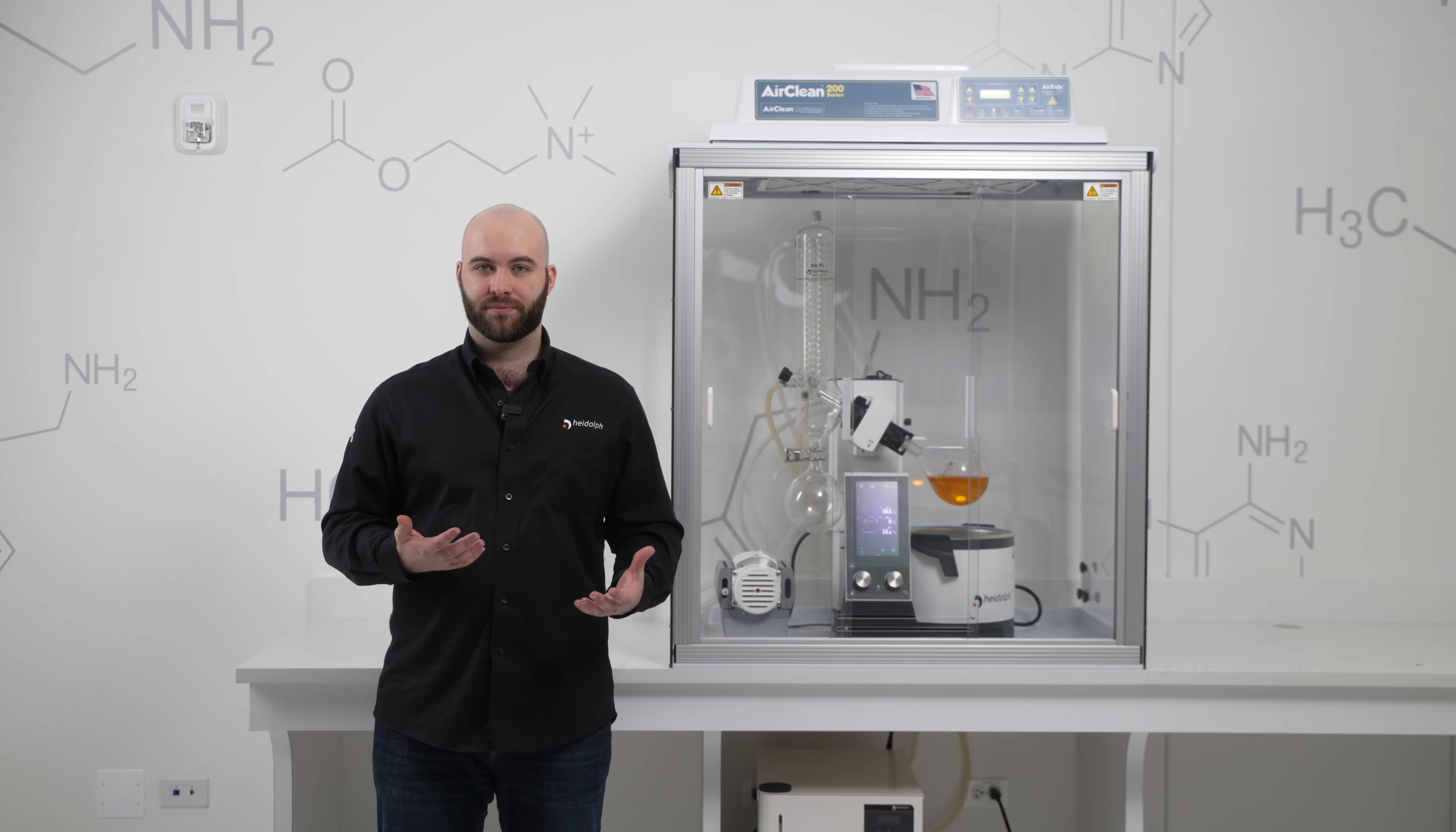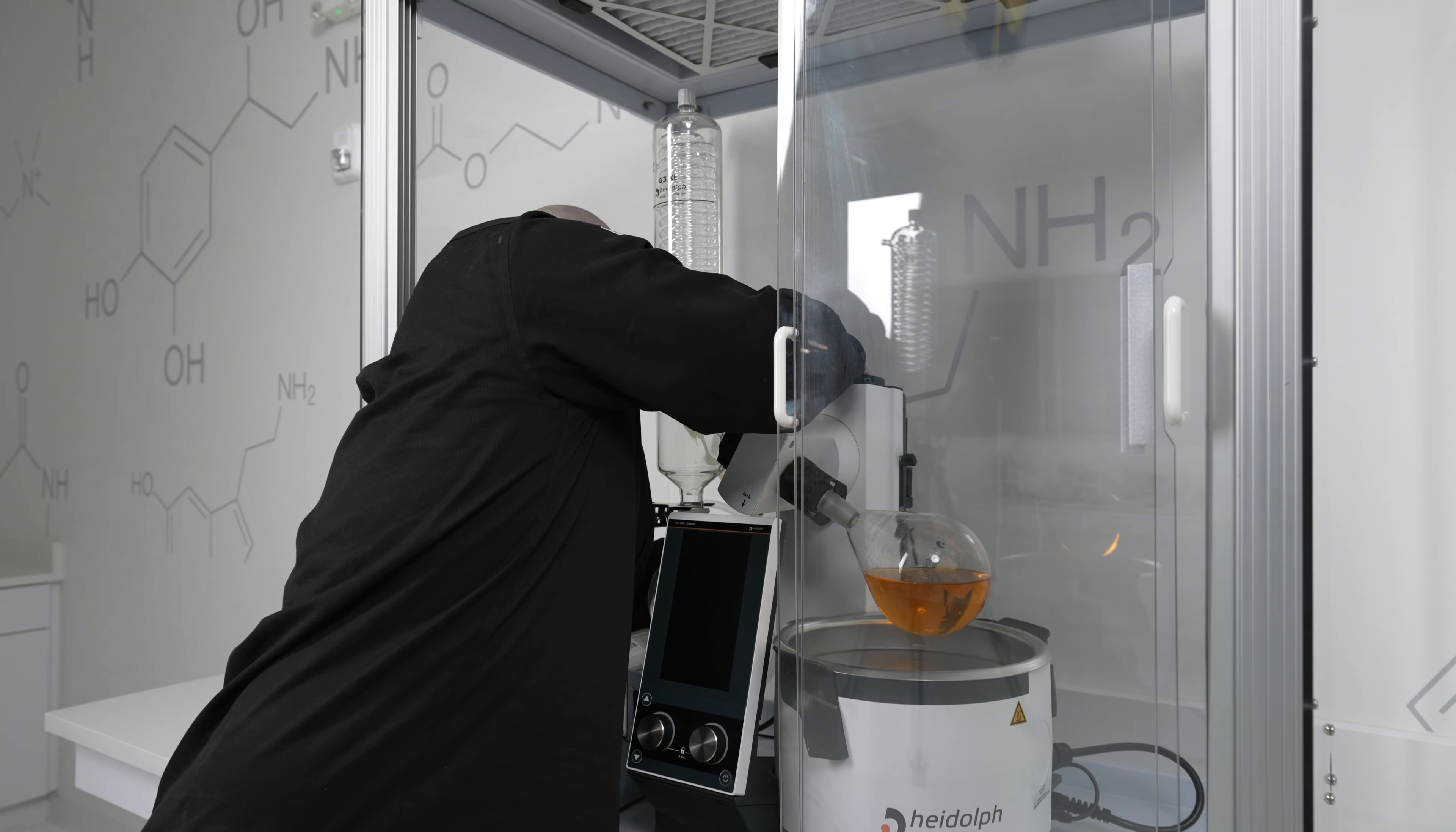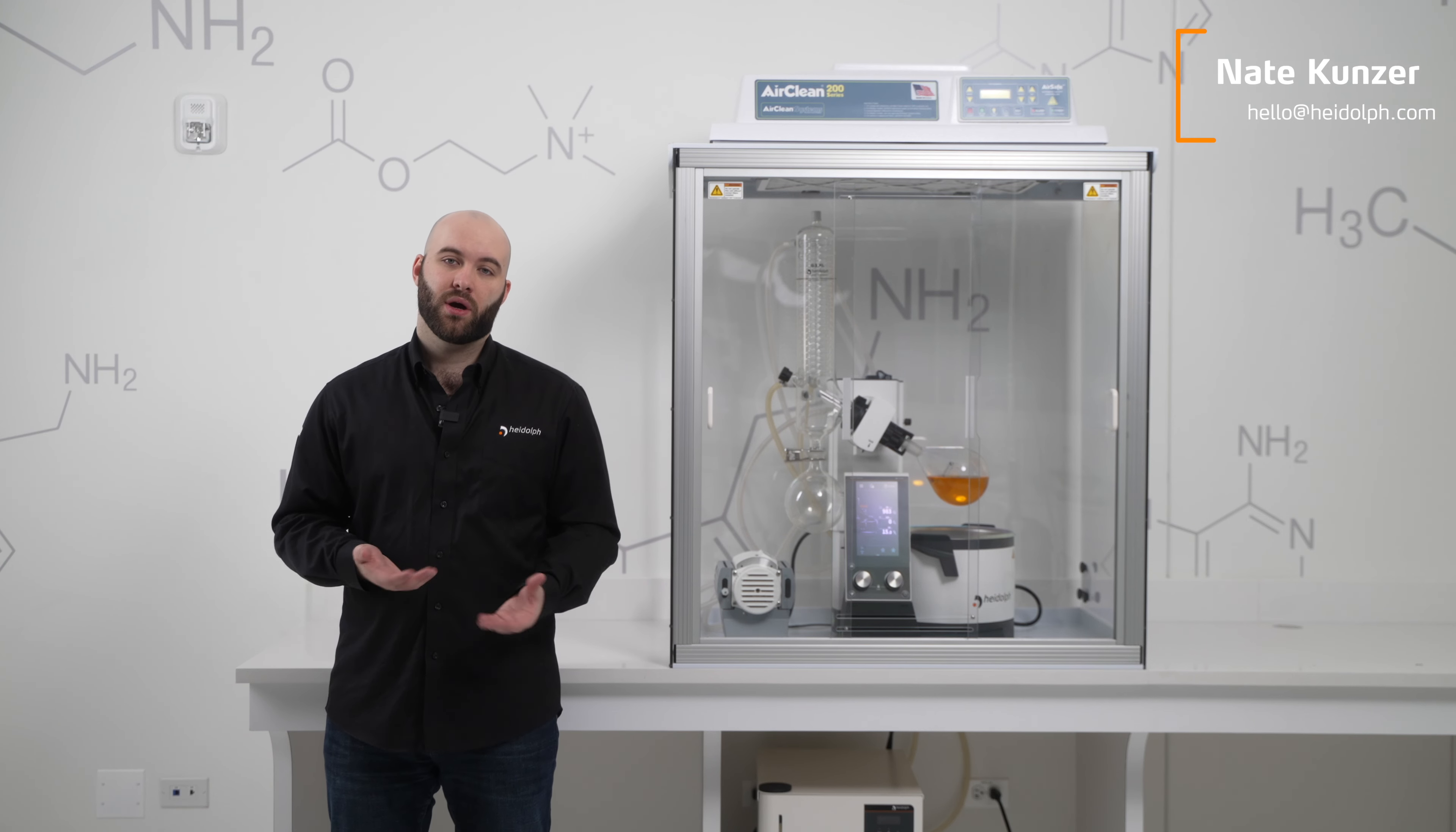These filters are specific to your application, so we know that they'll filter out the different solvent vapors that you are working with, and we're more than happy to help you choose those filters.